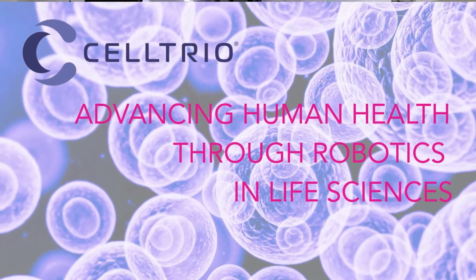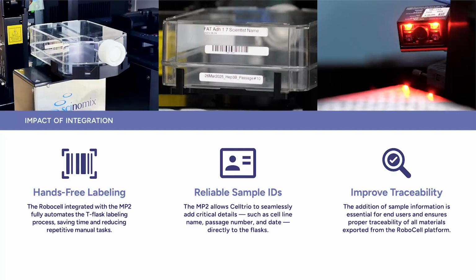Yep, that's great. And as you noticed in the MP2, we had our plates on the demonstration, but here we clearly have the nest showing with the flask, and I think that's been a really big win for both parties here in Celltrio and Scinomix. We'll continue on, Bruce, if you want to continue with this slide. No, absolutely, Nick. And I agree with you.